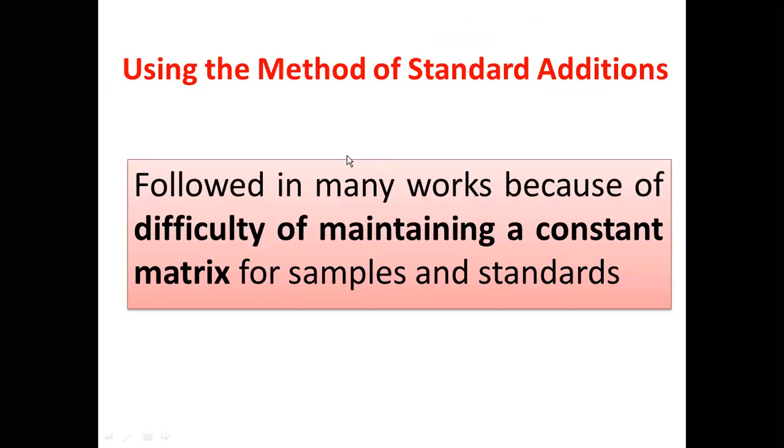Apart from this, we will also be using the standard addition technique. In potentiometry, we also use the standard addition technique. Whenever the concentration of the analyte present in the sample is too low, we can spike a standard into the sample. Therefore, we can enhance the concentration of the analyte in the sample, and without any error, we can determine its concentration.